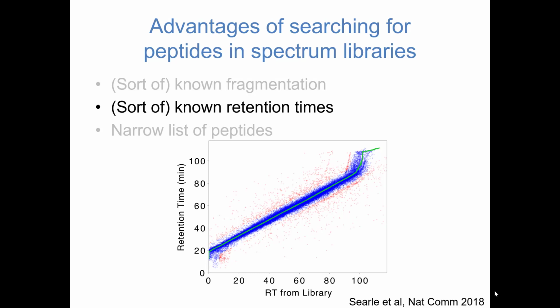But if I have used a spectral library with a completely different gradient, like a different effective length, then I better have a look at all the data I have there, right? Yeah, so in just a couple slides, I'll talk about that.